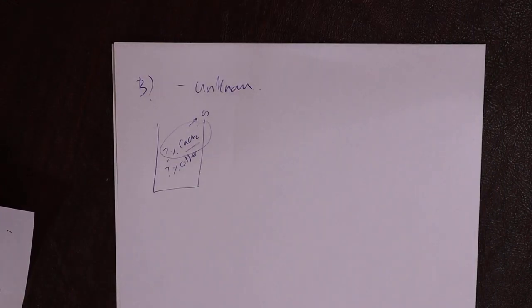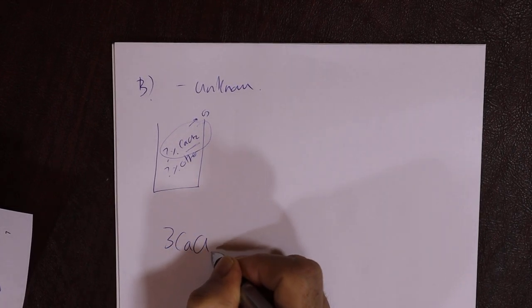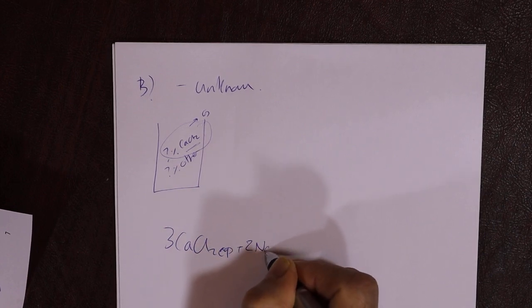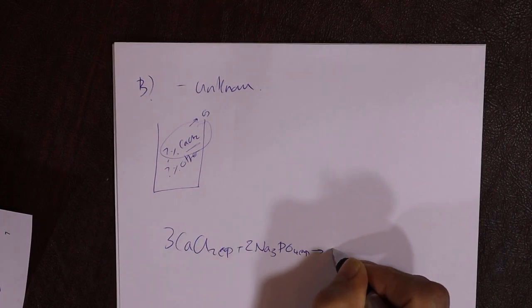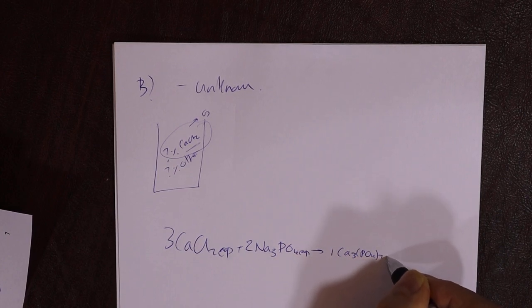Okay, so let's do that. We've got the same grid setup. Calcium chloride plus, and I'm going to write it balanced already because it's the same equation. Here we go.